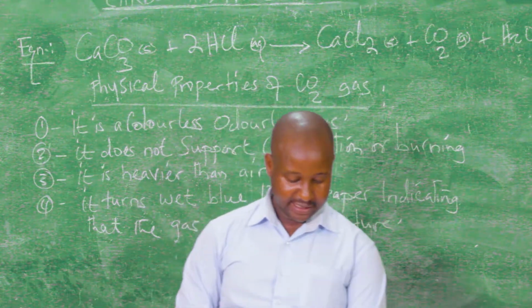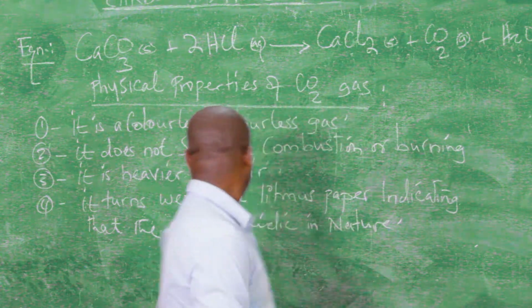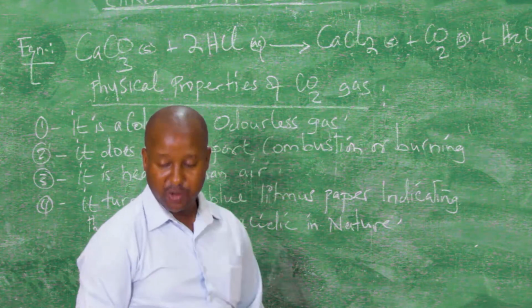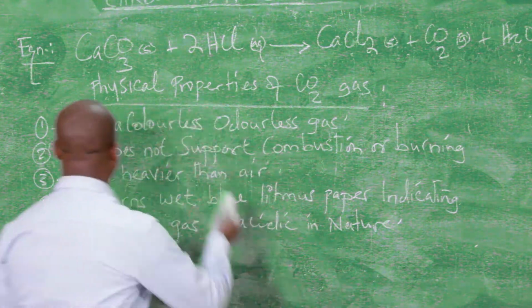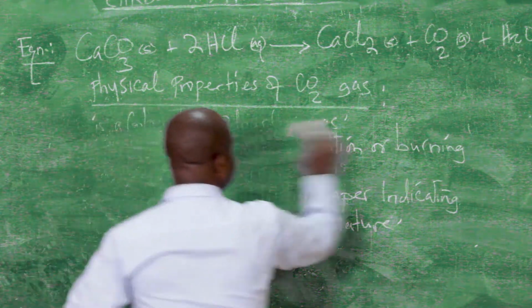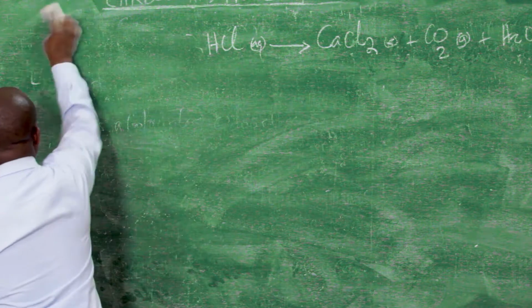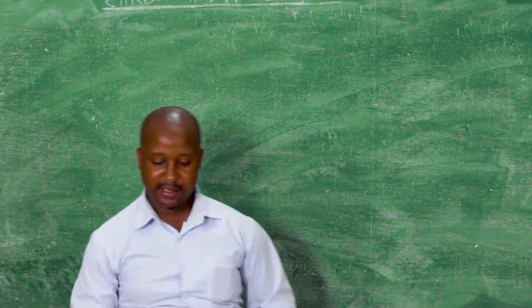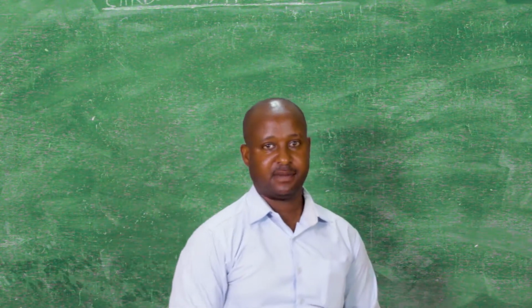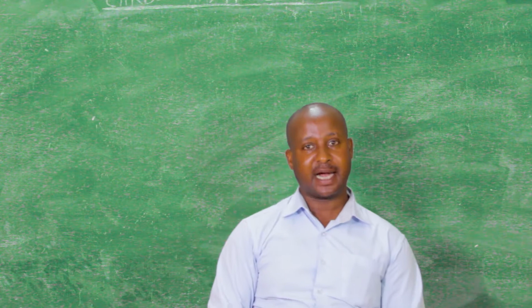Let's look at the test for carbon dioxide gas. How do we test for carbon dioxide gas in the laboratory? How do you confirm that such and such a gas is carbon dioxide?